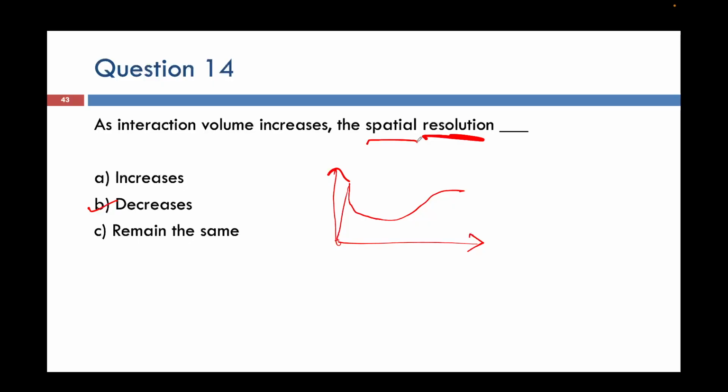So resolution, we have talked about 2 nanometer, this beam is coming, right? 2 nanometer means effectively I'm getting information from this using this 2 nanometer probe. But what is happening now? All of these electrons are coming out, whether it's SE and BSE, all of them are coming out. So effectively I'm getting signal from a broad range of energy. If I am getting signal from a broad range of energy, my resolution is decreasing.